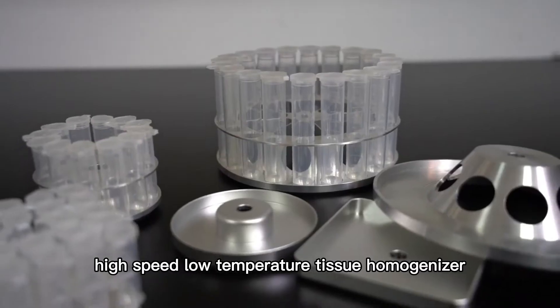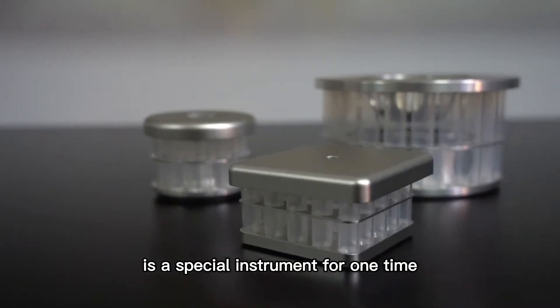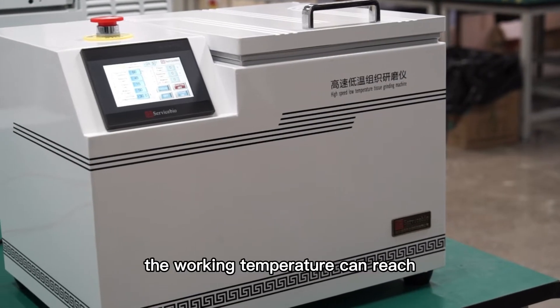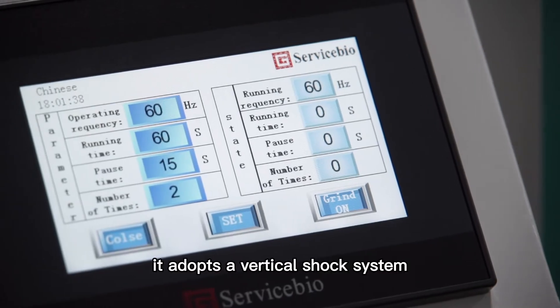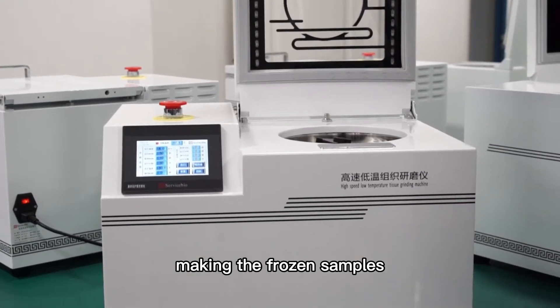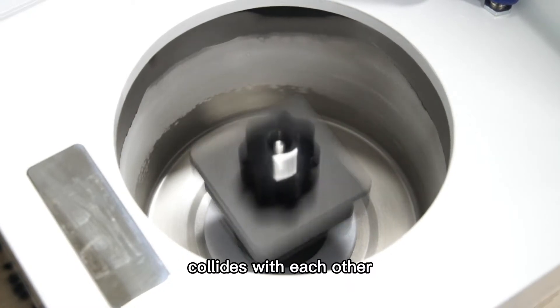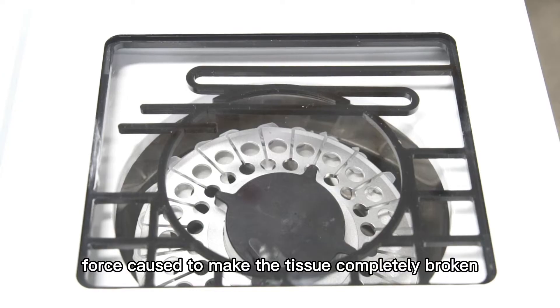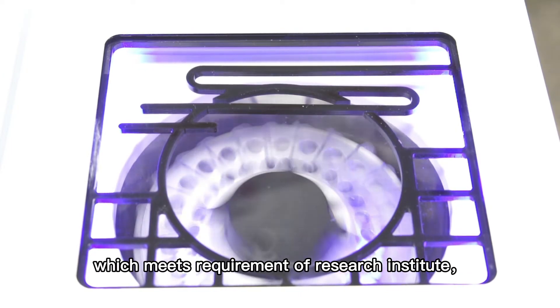KZ3FP High Speed, Low Temperature Tissue Homogenizer is a special instrument for one-time rapid processing of multiple samples. The working temperature can reach negative 30 degrees Celsius. It adopts a vertical shock system with high-speed reciprocating motion, making the frozen samples and grinding beads and grinding tube collide with each other. The grinding shear force and impact force cause the tissue to be completely broken.